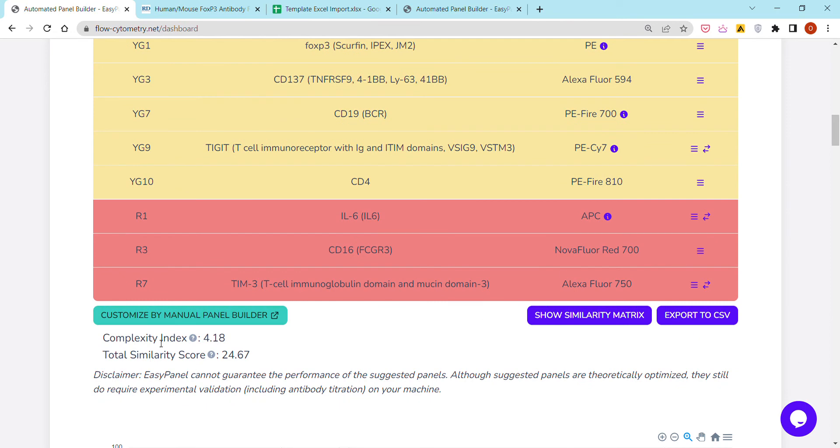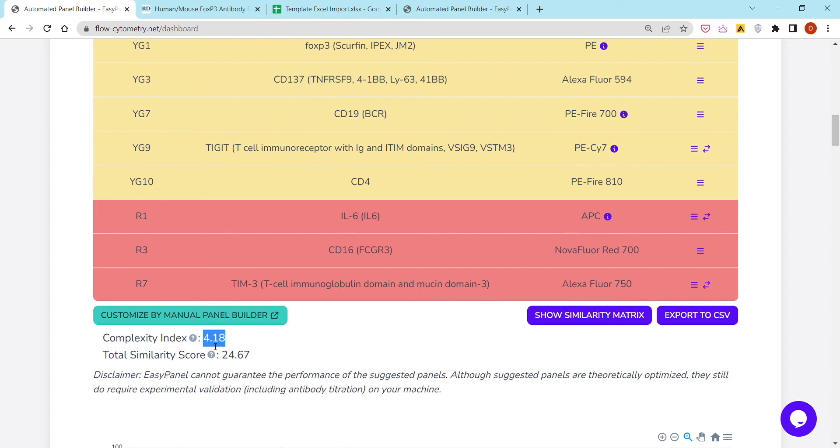Here are a few important pieces of information, including the complexity index corresponding to the panel that was suggested. As you may notice, this is actually a pretty low complexity index. This is as low as it can get for a panel of this size.